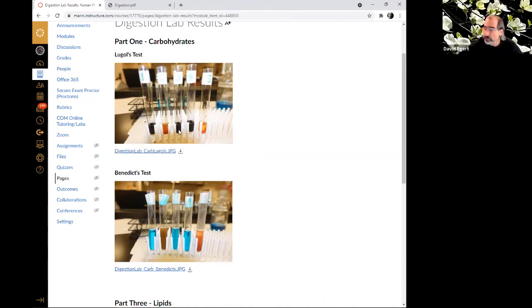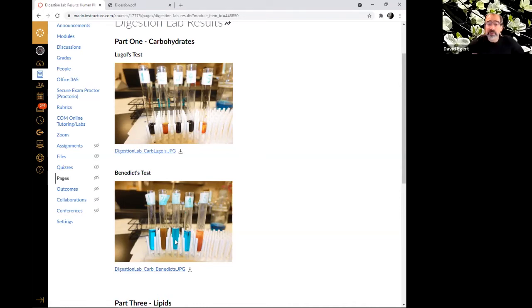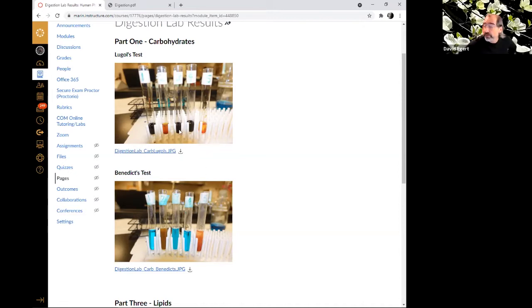If you look, we still have lots of starch. Starch didn't go away and no maltose appeared. So Grace, does this support your hypothesis for tube 3 or not? Yes, it does. Right. So we see like a complete inactivation of the amylase in the spit. Here, Becky's spit was completely ineffective at breaking down any of the starch.